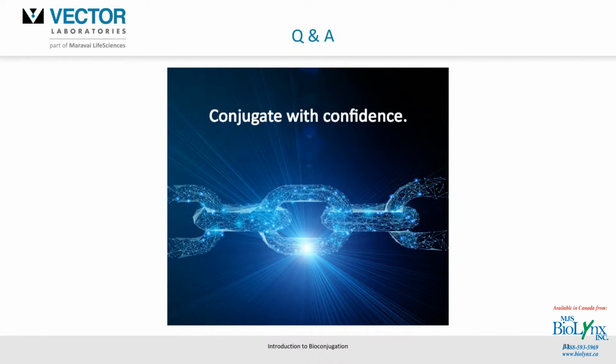The next question is, why should I choose Solulink over other bioconjugation kits such as Lightning Link? Fair enough. I didn't touch on other technologies that are out there. I did show that there are other ways to perform protein conjugation with that abbreviated table. We looked at sulfhydryls and things like that. But the Lightning Link technology certainly highlights how quickly it can be done. Interestingly, though, there's no cleanup step at the end. They put in a quenching reagent.